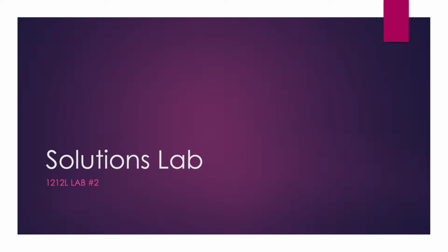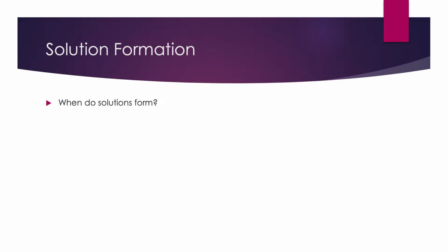Welcome to our second pre-lab video this semester for our 1212 lab here at North Georgia. This week's lab, we're going to be taking a look at solutions and solution formation and really talking about what's called solubility for both solids and liquids and for mixing multiple liquids together.